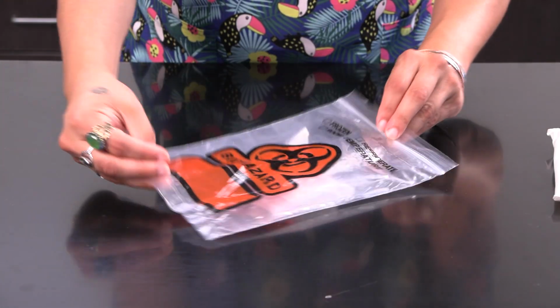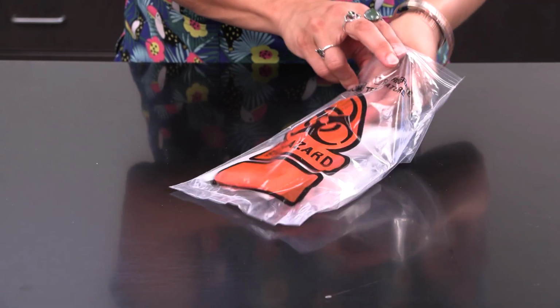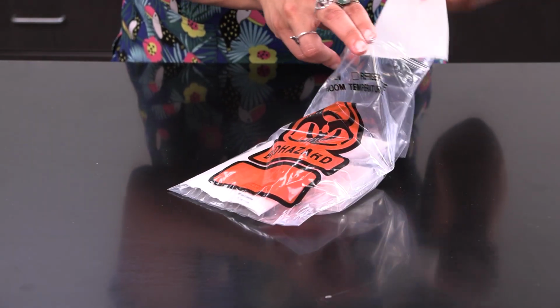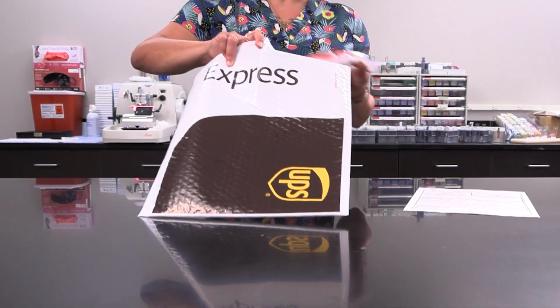For shipping, use cold packs during the summer months to prevent paraffin from melting. When submitting unembedded tissues in formalin, be sure to use a leak-proof container and select overnight shipping to preserve sample integrity.